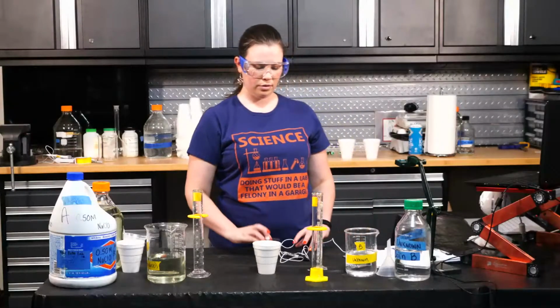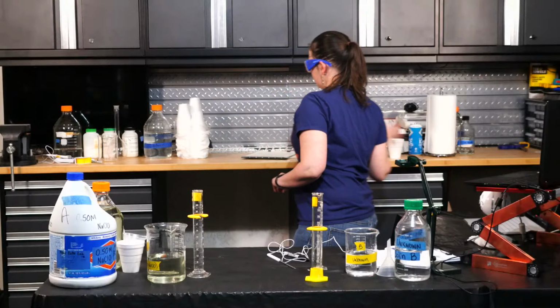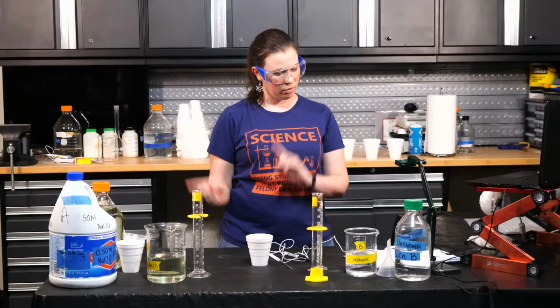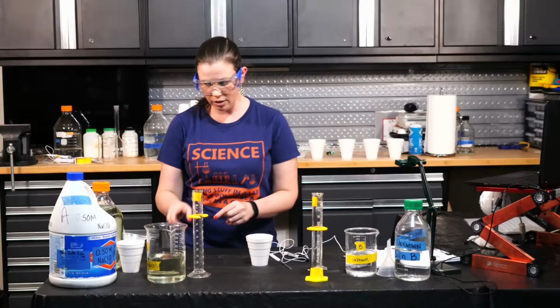All right, so that'll do it for level 5. Now that I have the right glassware, let's go back to level 1. So we've done levels 2 through 5. Now we're going to go back to level 1, where it was only 5 milliliters of the bleach.